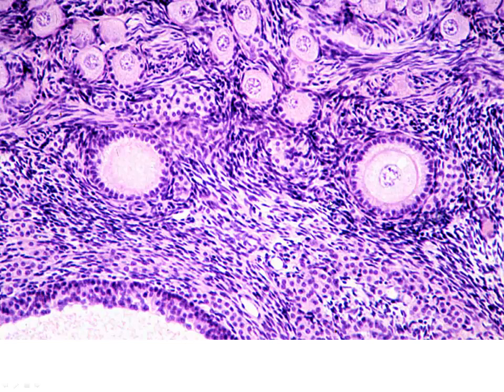Now, this is going to be our unilaminar primary follicle. Here we can see a single layer with our zona pellucida, with our oocyte, beginning to develop some of our theca cells on the outside. But here is a primary unilaminar follicle, also probably unilaminar, even though we don't necessarily see the nucleus in these. But you can see how these are more cuboid to columnar in size. Certainly they are larger than our primordial follicles.